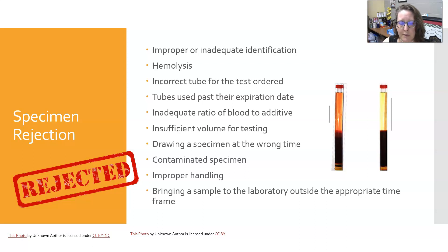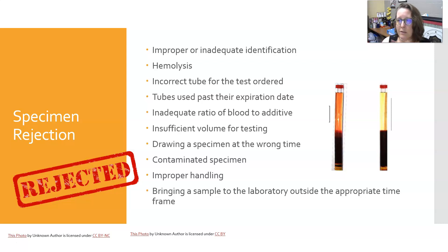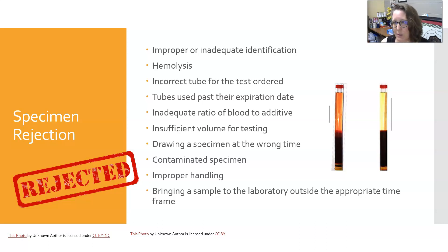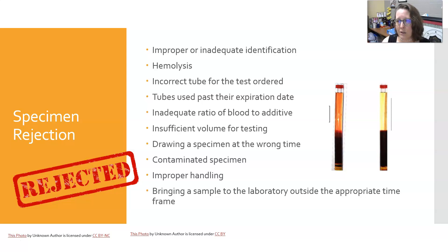A specimen can also be rejected if it was contaminated — for example, contaminated with IV fluid, or a urine specimen contaminated with feces. Improper handling — such as not keeping the specimen at the proper temperature, not protecting it from light, or not transporting it to the lab quickly enough — is another reason. Bringing a sample to the lab outside the appropriate time frame is also grounds for rejection, such as a urine specimen collected in the morning that isn't discovered until that afternoon or evening.